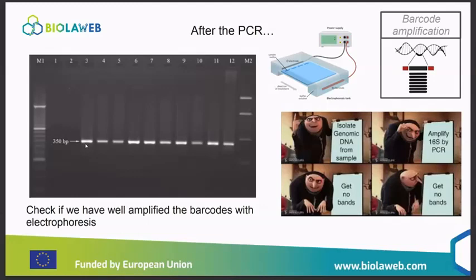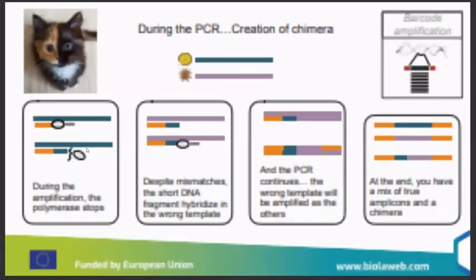And positive controls are used because the polymerase chain reaction can be complex. As you start from environmental samples, you can still have material from these samples, and the DNA polymerase won't work well. So a positive control is to see, okay, I did everything well for my PCR, it's just my template that has something wrong. As you don't see what you put in your tube, you want to be sure you put everything that is needed for the PCR.